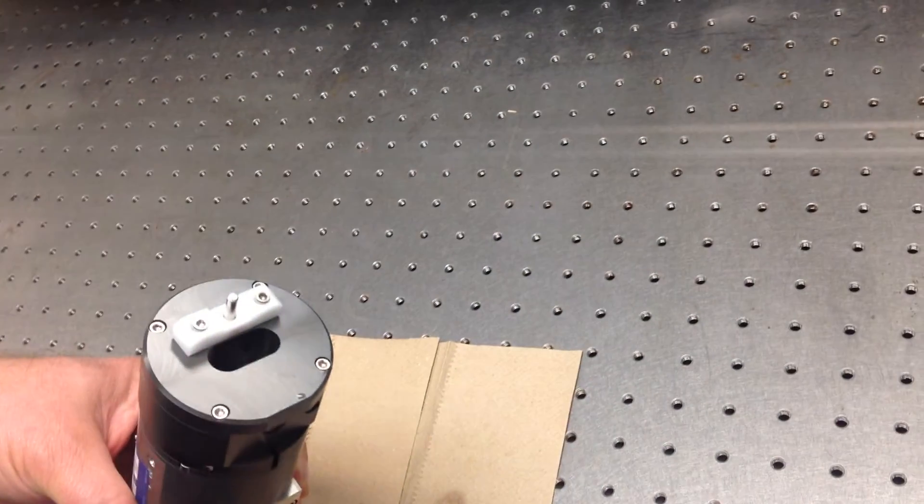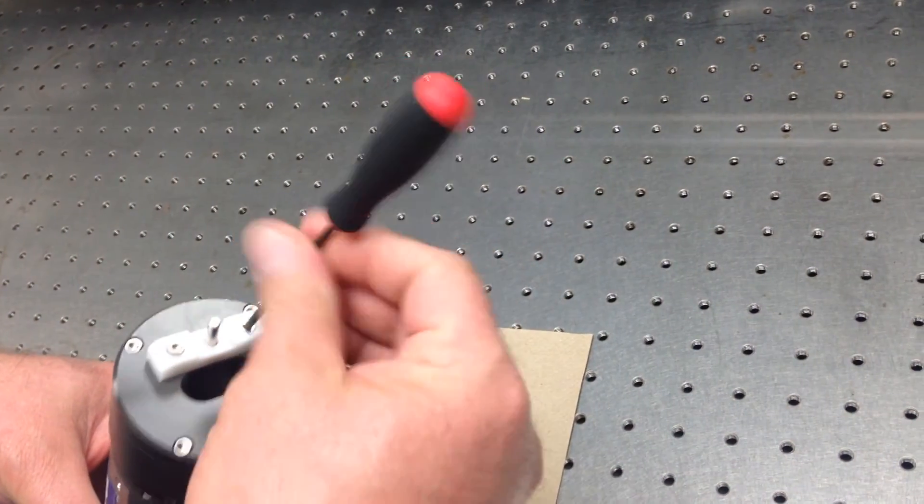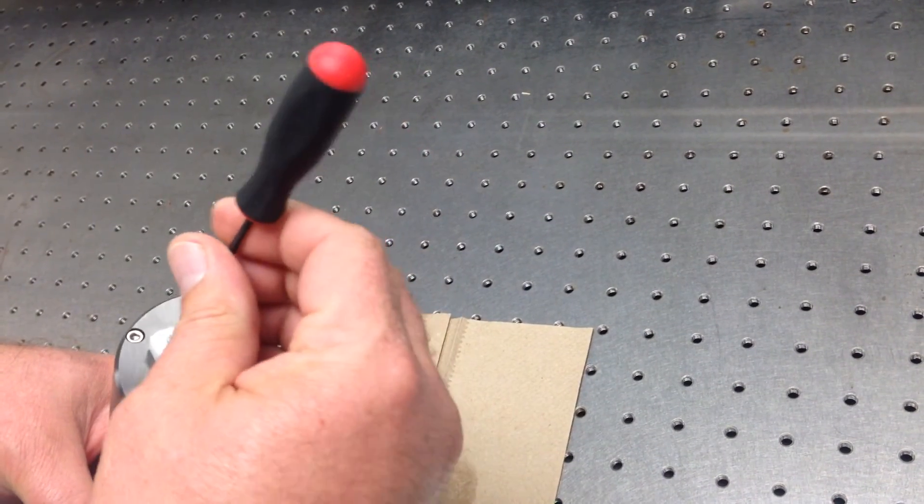All right. You just slide the clamp back down, retainer. Start tightening it up.